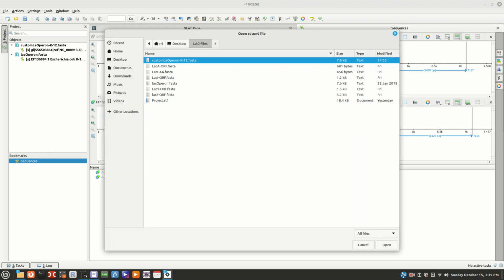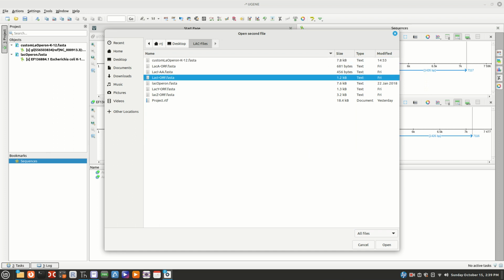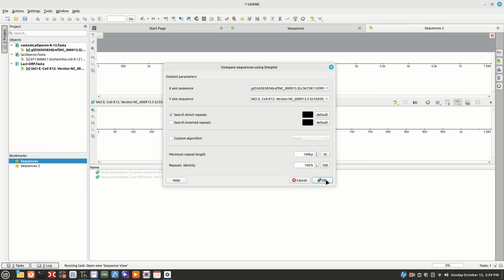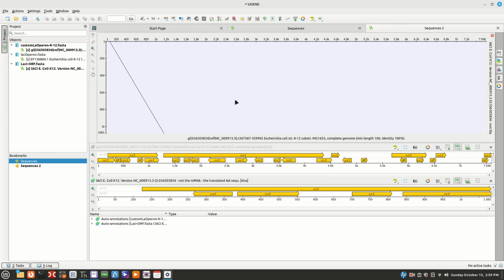Now, where do we expect to be? Just to make sure we find the lac-I where we think it should be. And yes, we found it up at the beginning. So here's where lac-I is. Lac-I is over here. And in here, ZYA are going to be here. All right, so that's great.